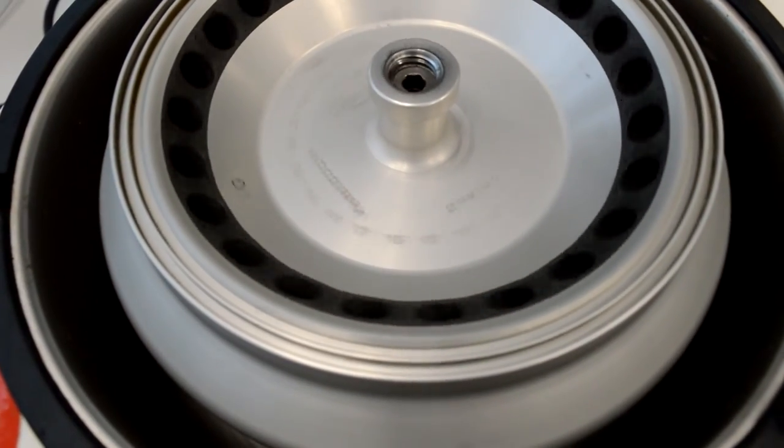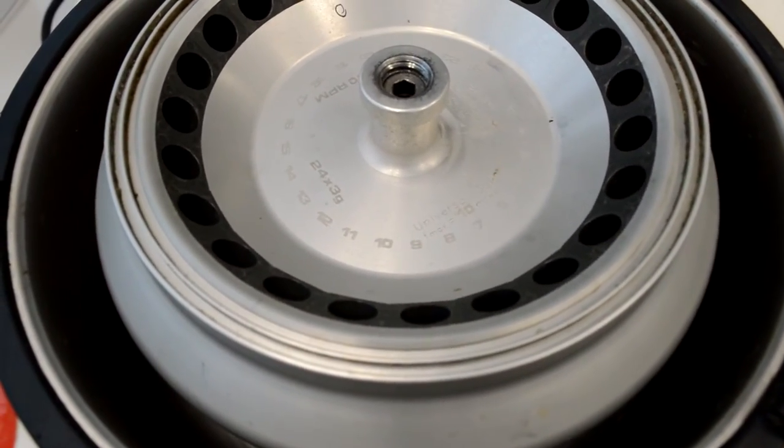The number of spaces on a centrifuge can alter from centrifuge to centrifuge, so if you're concerned, just check with someone. As long as they're sort of directly opposite each other, you'll be fine and they'll be balanced. If you're using just one sample, then fill another sample with just distilled water and put that in to make sure that you have an even number of samples within your centrifuge. You'll know if you've made an issue balancing your centrifuge if you have this really bad grinding, whirling noise, and it's like the most terrible sound in the world. So for the love of God, just try and avoid it whenever possible.